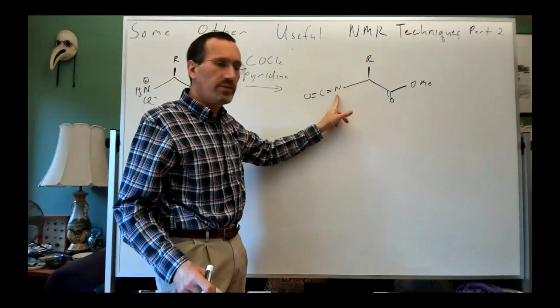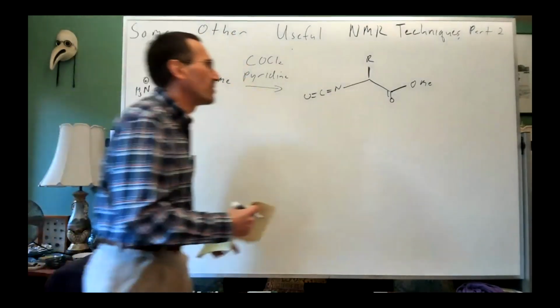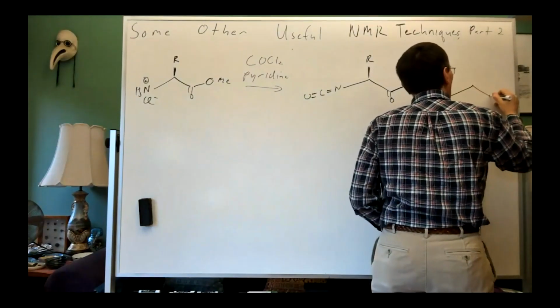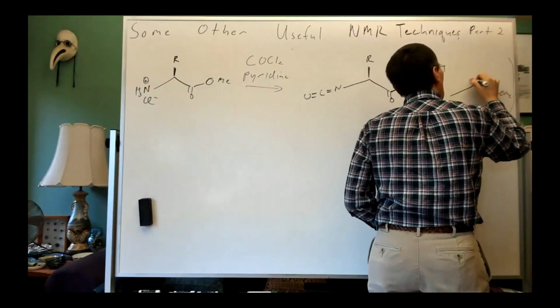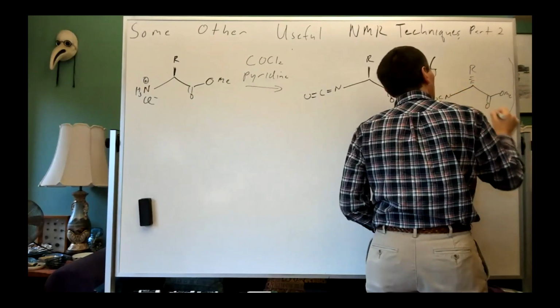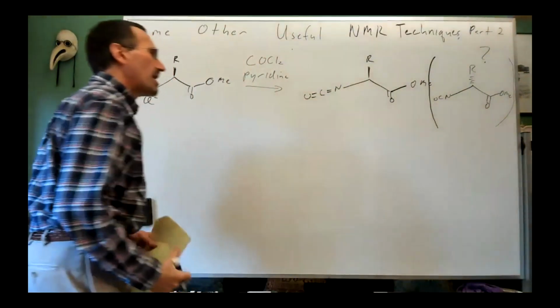We didn't know about the effect of this group, and we also didn't know about the effect of the pyridine base. So the question here was, did we also have the enantiomer? And if so, how much? And so I'll write sort of a big question mark over that.